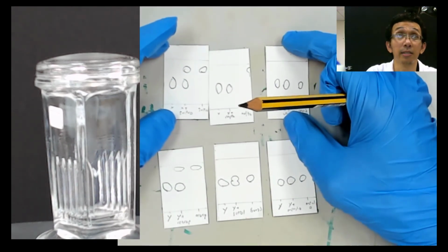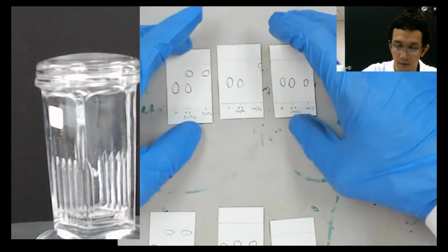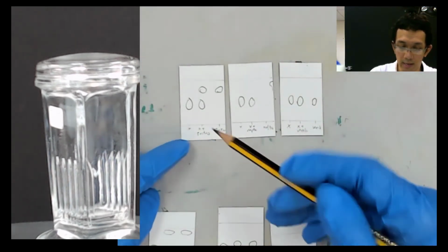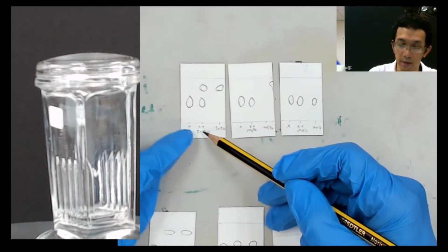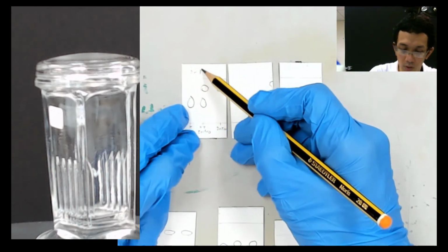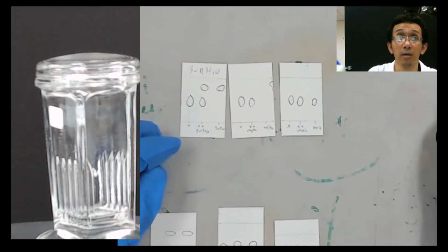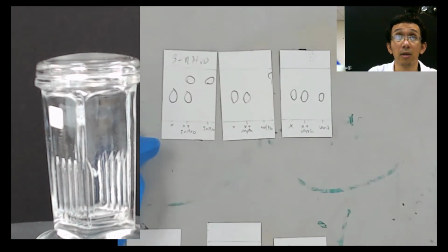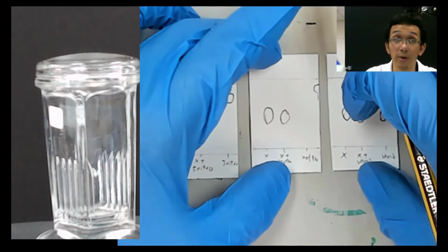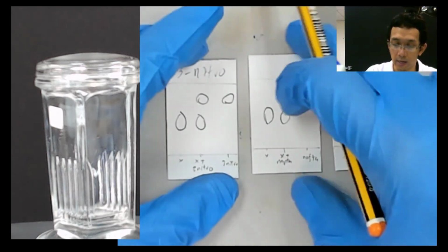You see here, this is X. Okay, this is X. So let's look at X first. From this thing, what is X? So let's say in the middle here, let's say this is 3-nitro. This is 3-nitro. This is naphthalene. So I make it bigger. I hope you can see now. Let's say this is left, middle, and the right. So anyone, what is X?